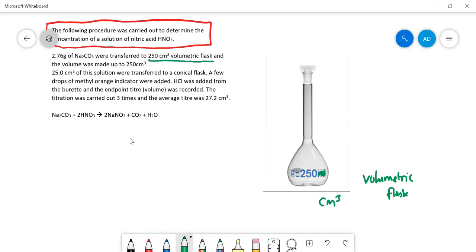We don't use mils, we always use centimeters cubed. You can see there's a little mark there, a little ground glass mark, and what you need to do is add the liquid until your meniscus is just sitting on top of that mark. Once you've done that, then you've got exactly 250 centimeters cubed in the flask.